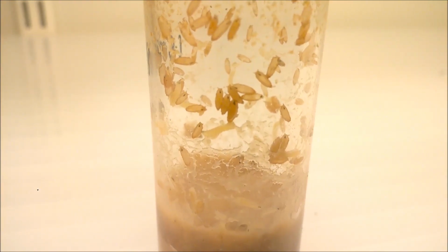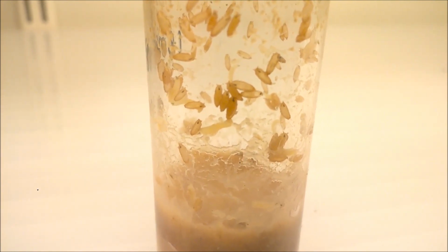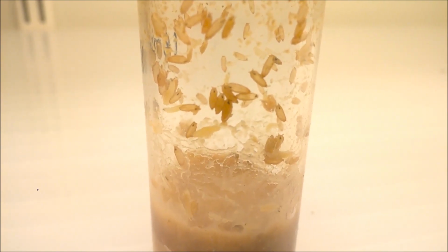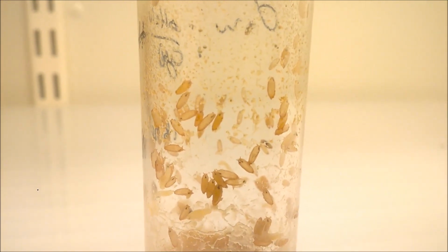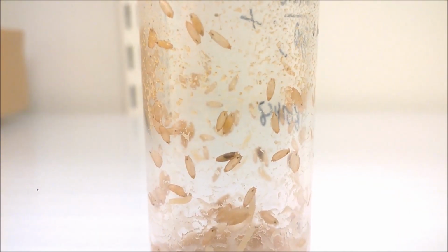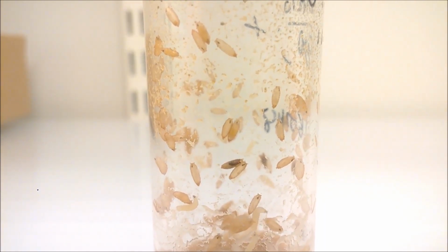After mating, females will deposit eggs on the food provided in the bottom of the vial. Larvae will hatch from eggs, and soon after they will start feeding, they will grow and they will pupate, as you can see over here. In the middle you see a pupa which is darker. It means that an adult is about to be ready. Soon this adult will emerge.